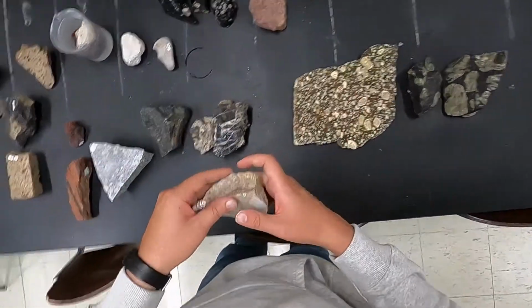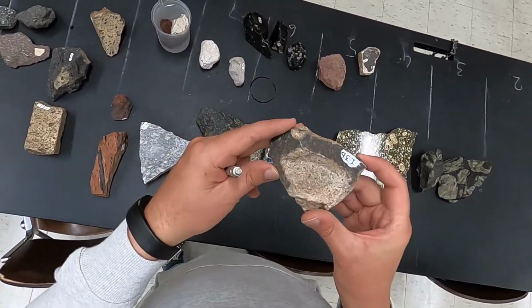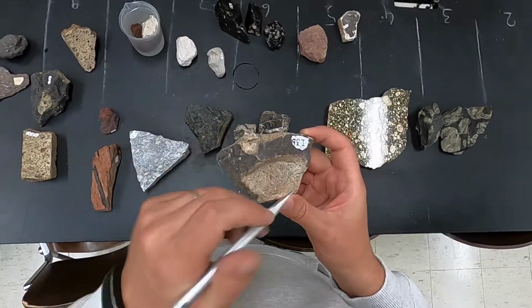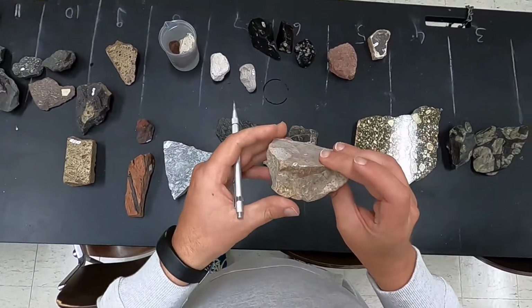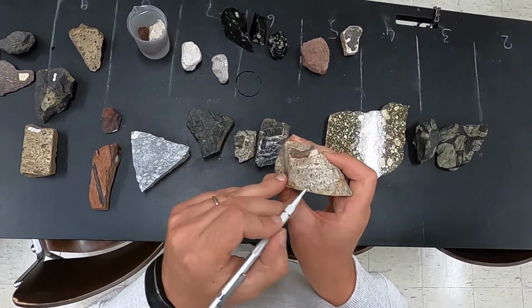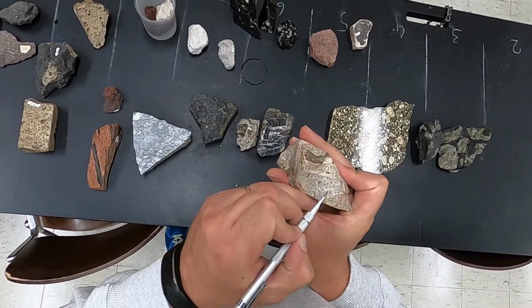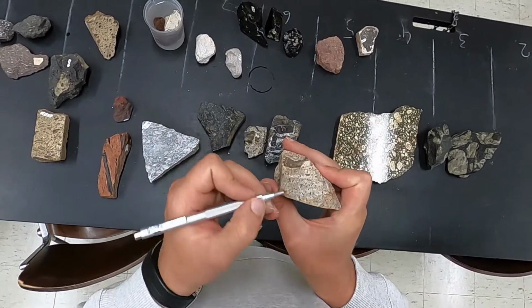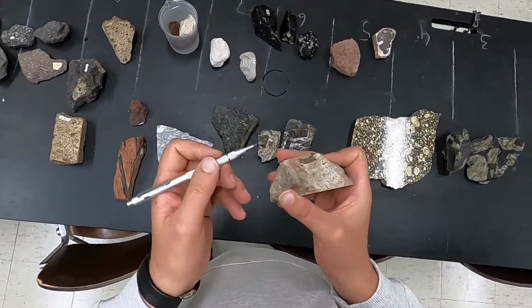The same could be true for this rock, but you can see here we have much more mafic minerals present. So that's also a thing you have to be careful with if you start to see a lot of mafics, which are illustrated by the elongated sections. If you remember, I mentioned the existence of amphibole and pyroxene.